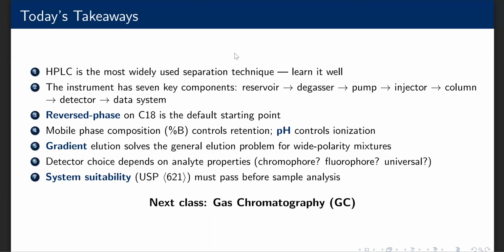In the next lecture, we switch to gas chromatography. The fundamental principles are identical, but the implementation differs because the mobile phase is gas rather than liquid.